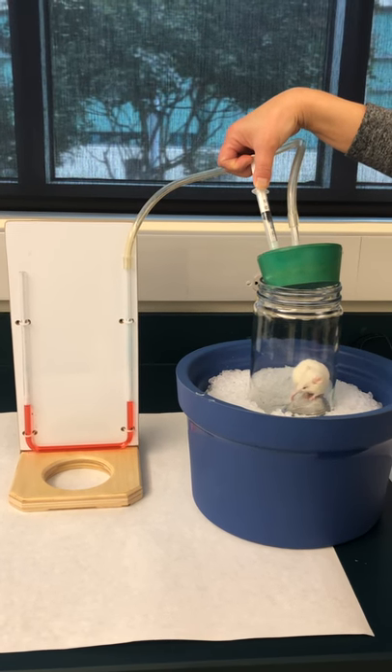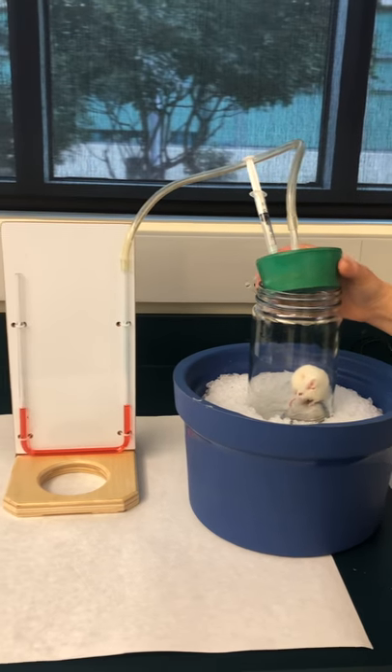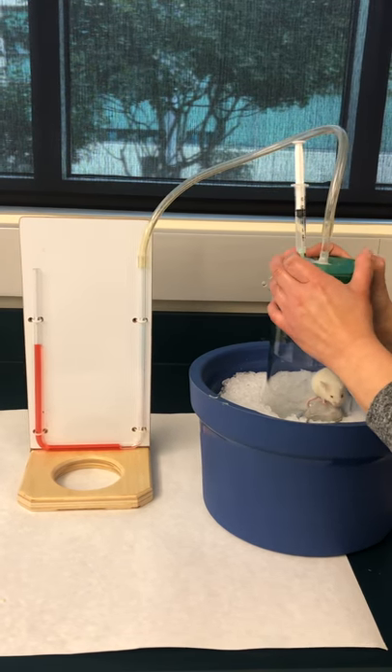So now we're going to do this trial again, but now the mouse is on ice. Janine's pulling our two cubic centimeters, and we're going to seal the lid on there.